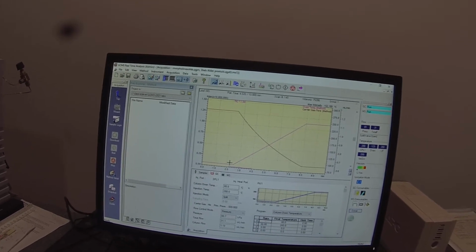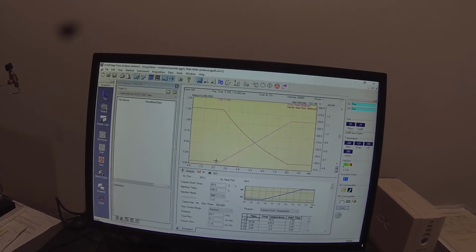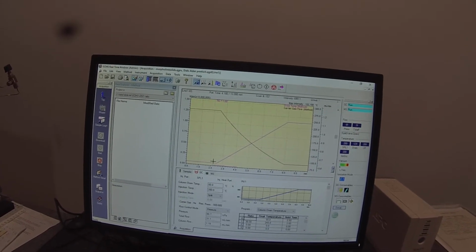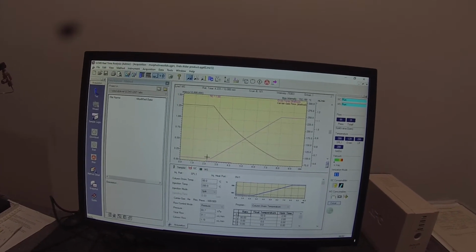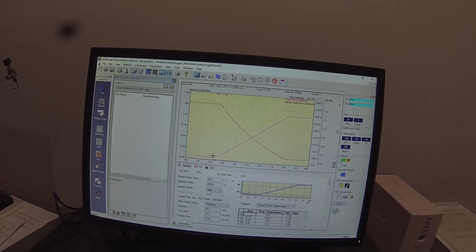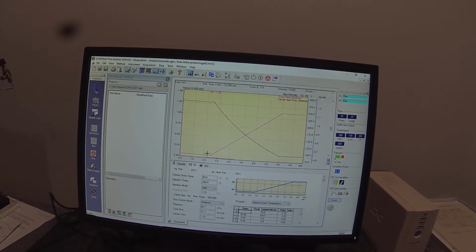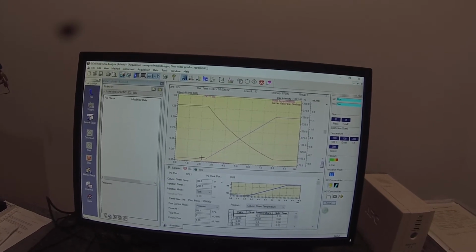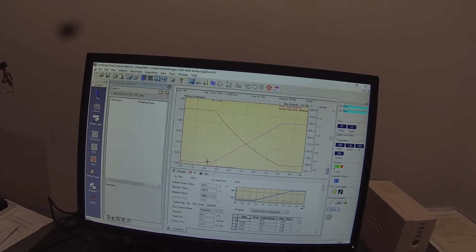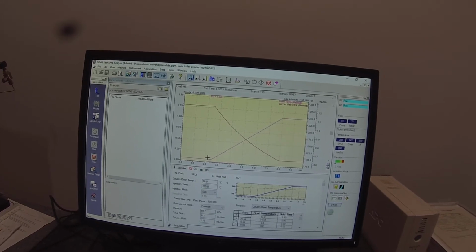So hopefully, even if the lower temperature is not good enough to get this compound through the column, once we hit that high temperature... Remember that the total run time was only 3 minutes for the gas chromatograph that we followed this reaction with. But we were running at a fairly high temperature, much higher than this 80 degrees that we started at with this one. So I wouldn't necessarily expect it to come through quickly, but I am hoping that it comes through.